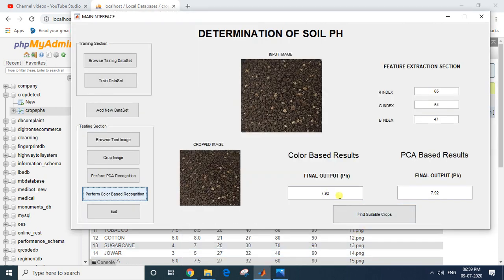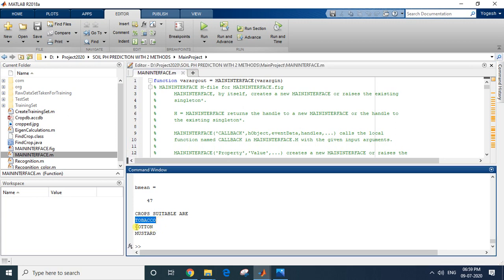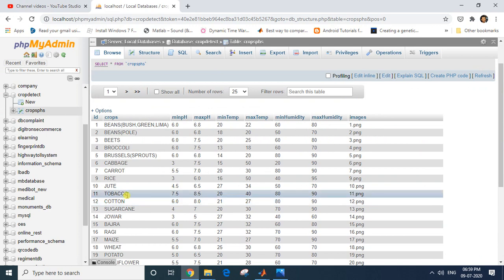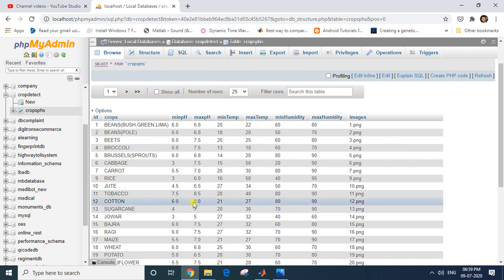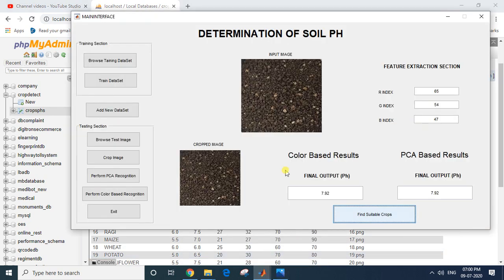I'll click 'Find Suitable Crop' matching this particular pH value. The results appear in the command prompt. The suitable crops are tobacco, cotton, and mustard. For example, tobacco has a minimum pH of 7.5 and maximum of 8.5, so our value of 7.92 lies within that range — same for cotton. This is how the project is implemented.